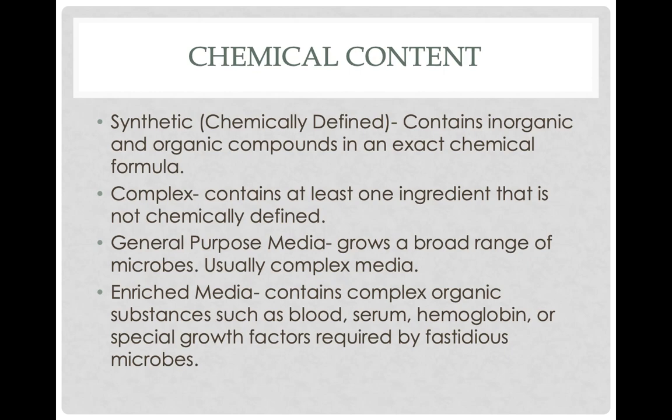It's a complex media, tryptic soy, nutrient broth, contains beef broth, beef peptone agar, BHI, brain heart infusion, all that kind of stuff. It just grows pretty much every single bacteria that'll grow on it. If it's gram positive, gram negative, if it's a coccus, if it likes to eat sugars, if it likes to eat proteins, it doesn't matter. It'll pretty much make them happy and they will grow.